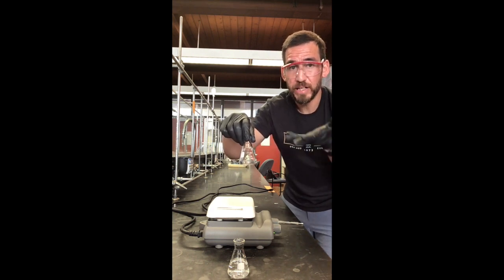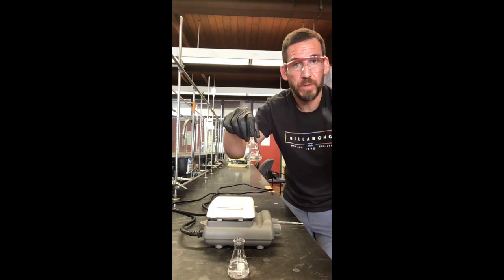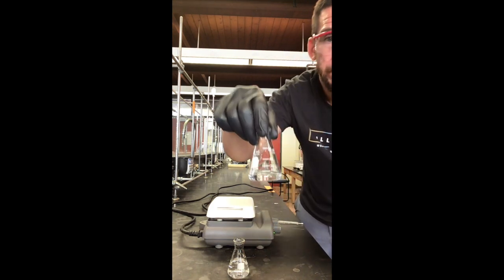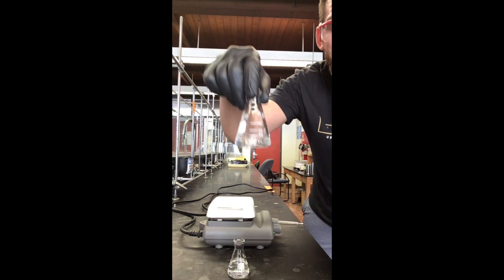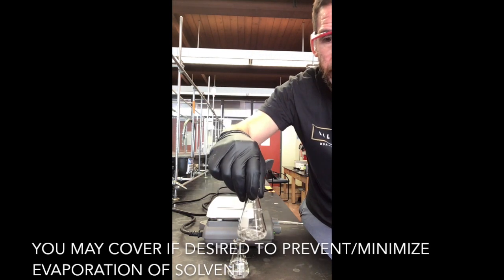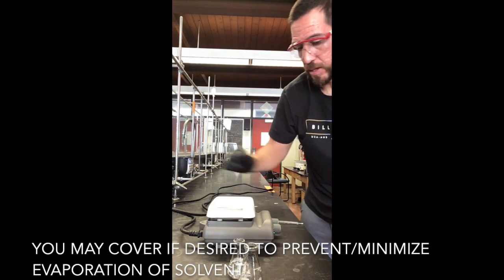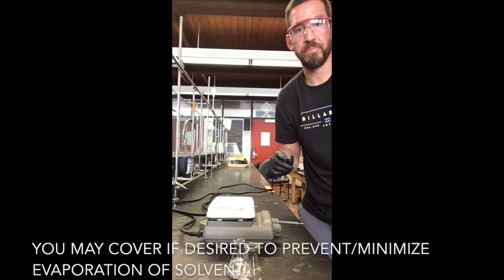And if it's saturated in hot ethanol, as it cools, a lot of that caffeine is going to precipitate out or form crystals. And so now that we've got it all dissolved, I'm going to go ahead and place it on the bench. Okay, I'm going to go ahead and turn the heat off.